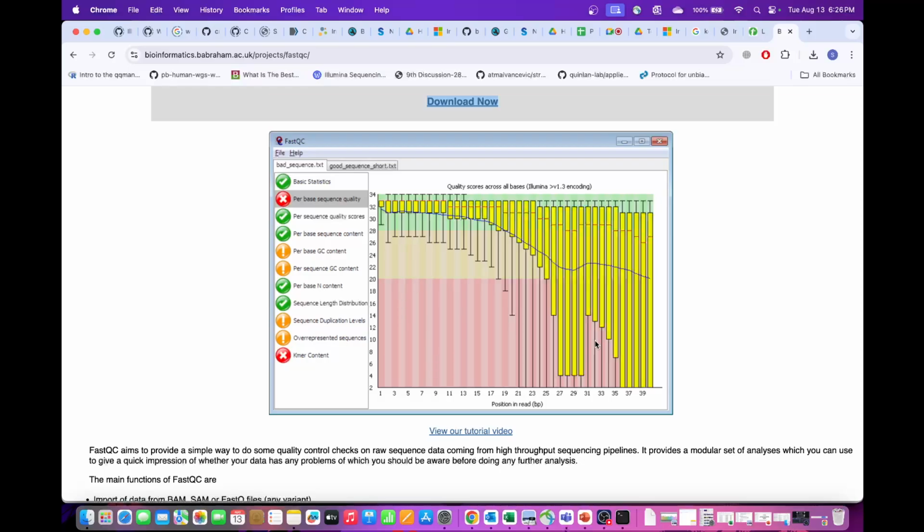But remember one thing, maximum software will work best while you are running them from the source. In Conda there will be some limitations because Conda is basically a wrapper of the software which is deposited in the Conda library and you're downloading it. So all the functionalities might not work. I'm not saying it will not work, but it might not work.